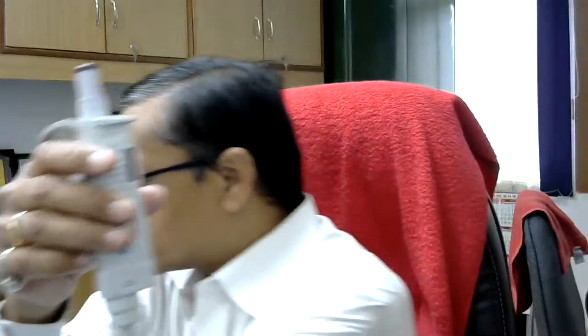So this particular pipette is a 2.5 microliter pipette. So 0.1 microliter to 2.5 microliter can be measured using this pipette. Okay. So you can see here readings are there. You have to adjust the reading.